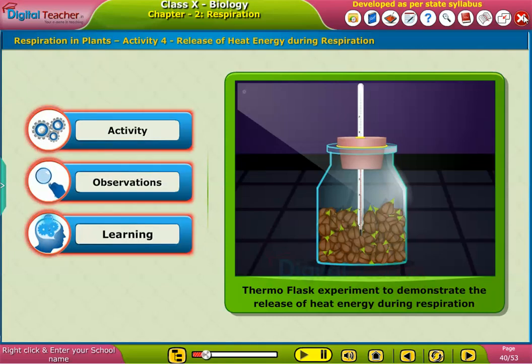Here, let us perform an activity on how heat is produced in germinating seeds during the process of respiration.